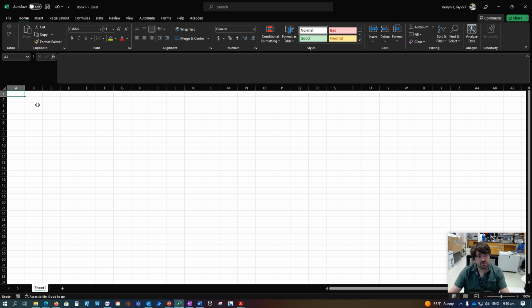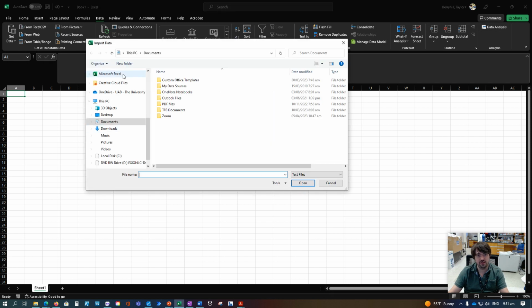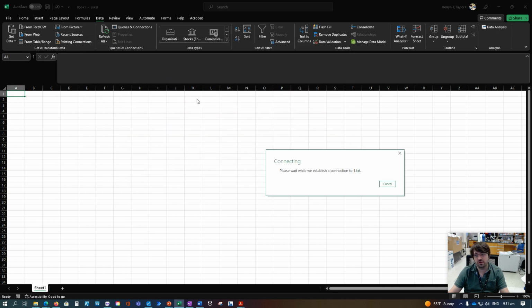All right, so this is if you have a data set with greater than 5,000 samples, or 5,000 aligned features rather, not samples, and you want to take the top 5,000 or perhaps make a bin of the first 5,000 and the second 5,000. We're just going to do the top 5,000 to be easy about it. We're going to go to data, CSV, and select it. We have one on our desktop, and it is this one right here.